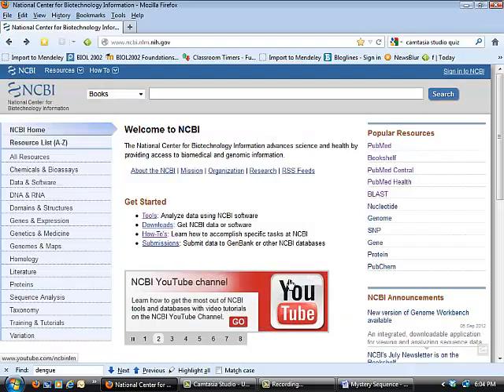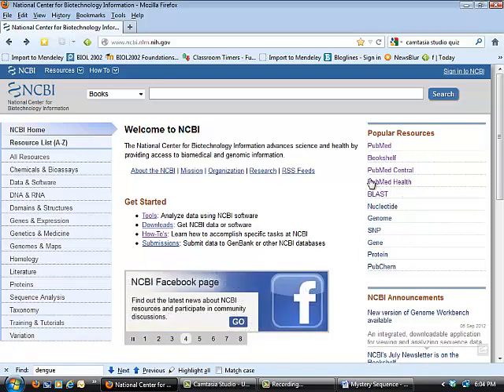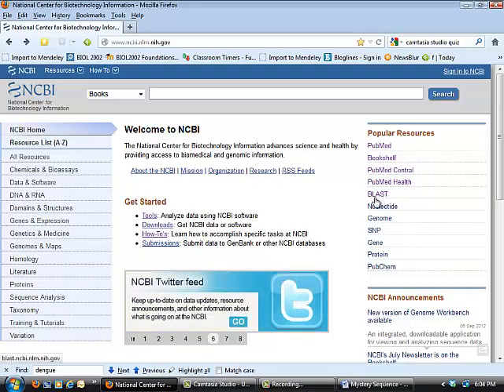And what I'd like us to do now is to use the BLAST tool. BLAST is one of the most important tools in NCBI for molecular biology purposes. I can personally say that it's probably one of the most common things that I use in NCBI. Probably the most common, except for perhaps maybe PubMed itself. I'm going to click on the BLAST link right there.